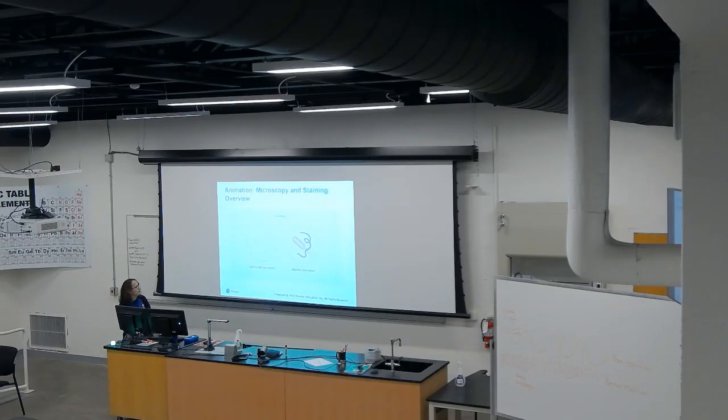It was super short. So yeah, you need to have staining to get this type of images.